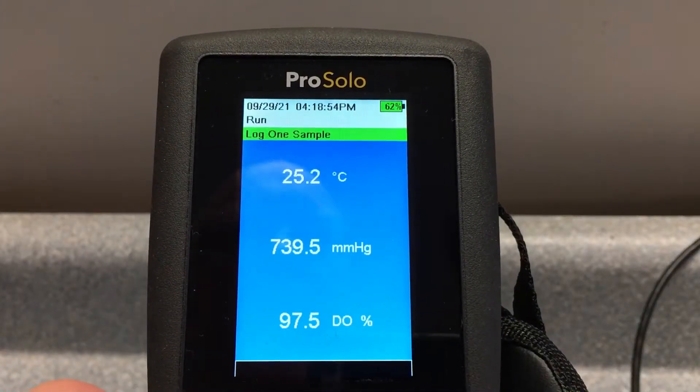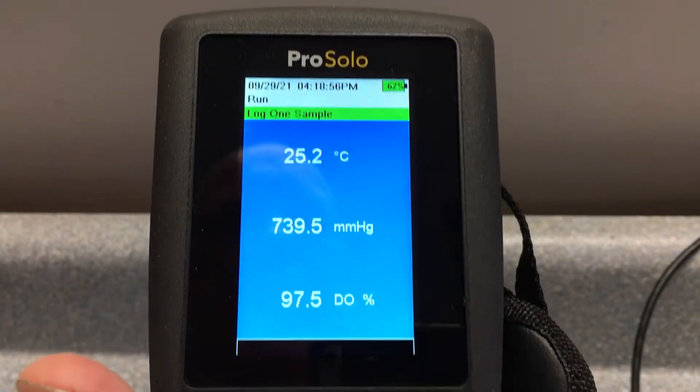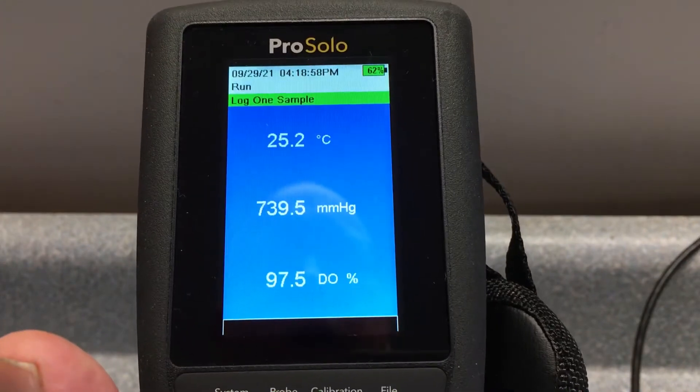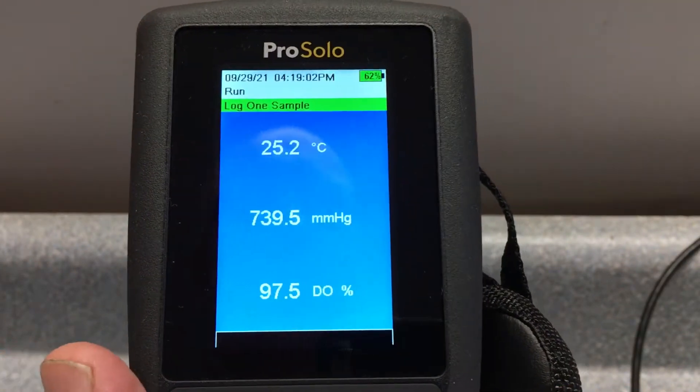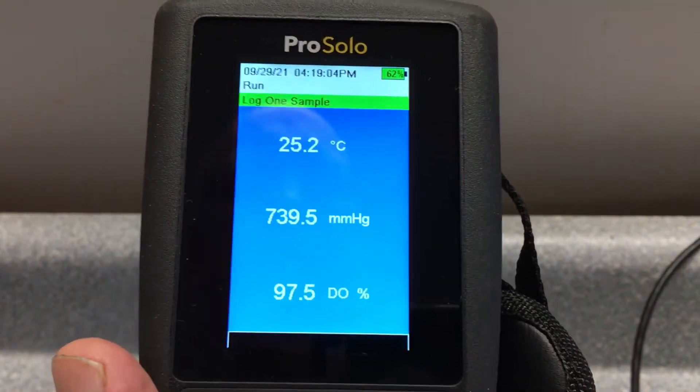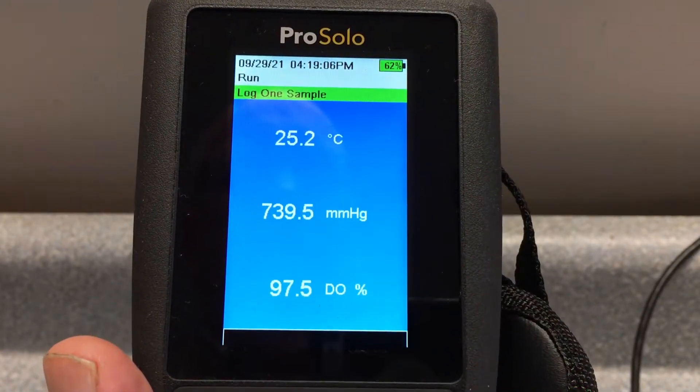Today we're looking at the YSI Pro Solo handheld, and we're going to take a look at just a couple things related to some basic setup. I'm going to walk through the menu system and do a simple calibration.